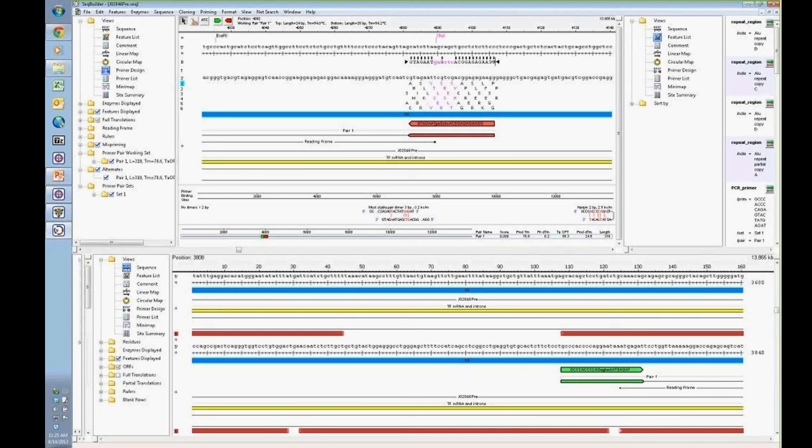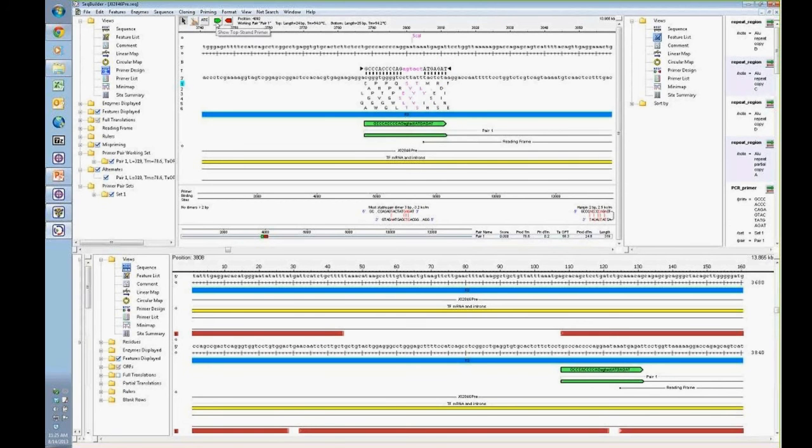So when we amplify this target, essentially it's going to cut right at this XhoI site. So this information at the 5' end of my primer is going to be cut anyway, and the same thing is going to happen here at the 5' end of my probe. So now we've resolved it: we have no dimer issues. We don't have any significant issues with the primer binding with the bottom strand primer. And our hairpin information is suitable, based on the software.